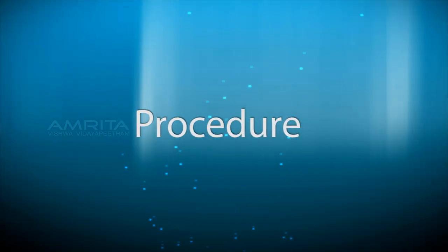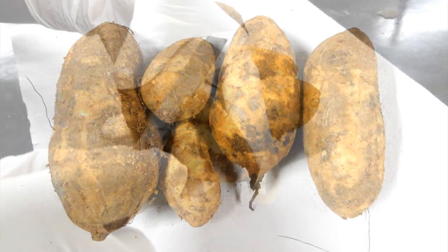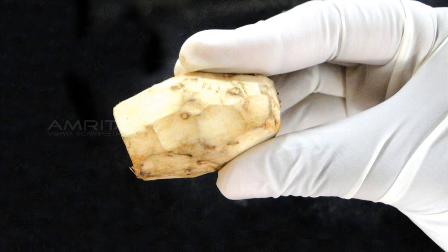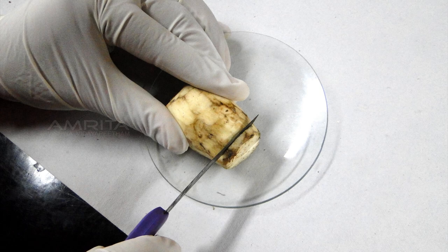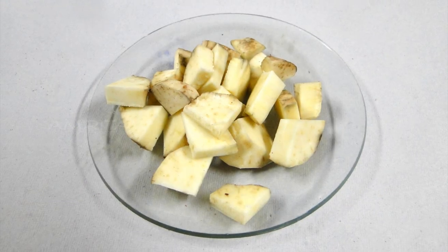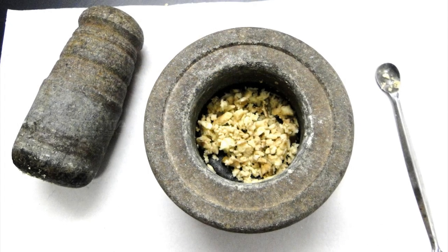Procedure: Take a clean sweet potato and peel off the skin. Weigh the peeled sweet potato and note the weight. The sweet potato is cut into small pieces and transferred into a mortar and pestle. The crushed pieces are transferred into a blender.